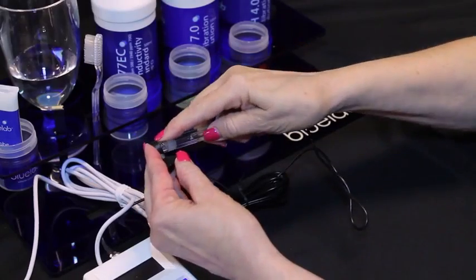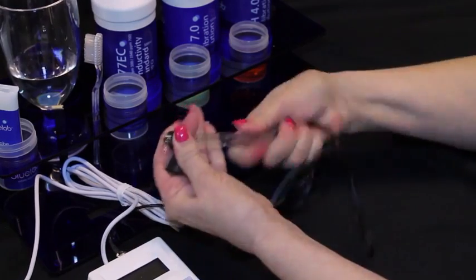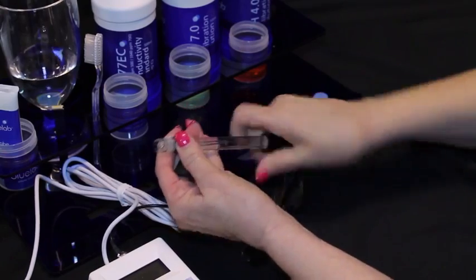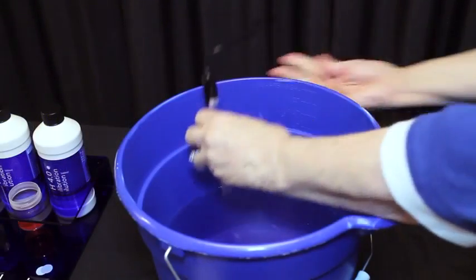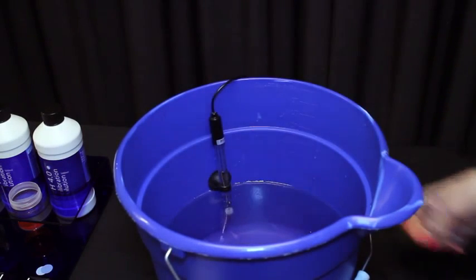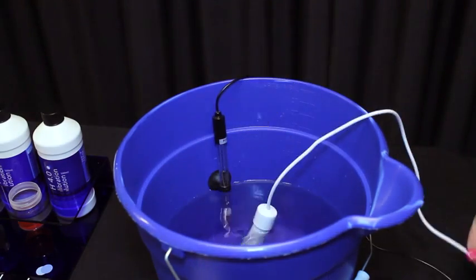The probe needs to be submerged in liquid for a measurement to occur. The pH probe comes with a suction cup to prevent permanent damage to the glass probe. Remove the pH probe storage cap, then gently twist the suction cup onto the stem of the pH probe and lightly push it onto the side of the reservoir, far enough down so the pH probe is in the solution. Place the conductivity temperature probe in the solution as well.